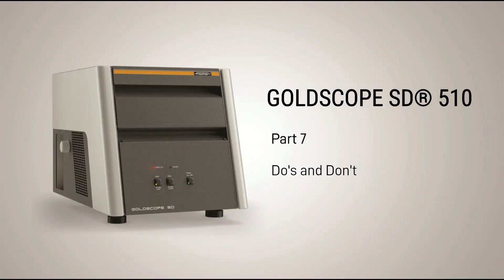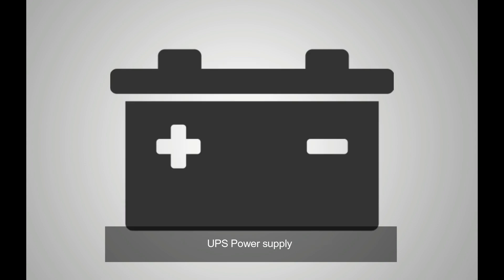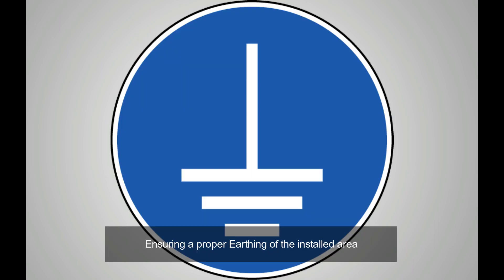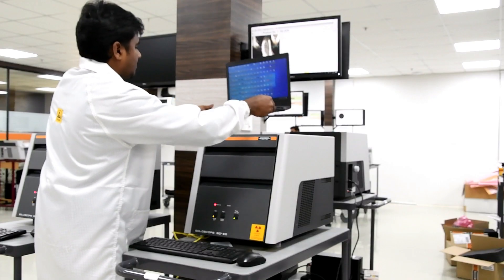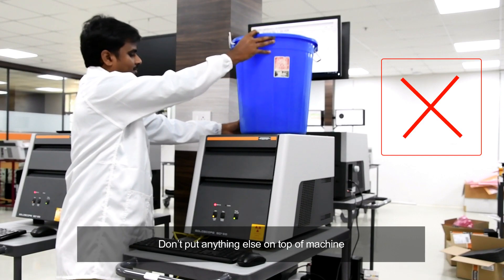Ensure that you complete all the pre-installation procedures such as placing a UPS machine, isolation transformer, providing an air-conditioned environment for the working of the machine, and ensuring perfect earthing conditions at the place where the machine is installed. You may place a desktop or laptop on top of the machine to save space, but avoid placing anything else on it.